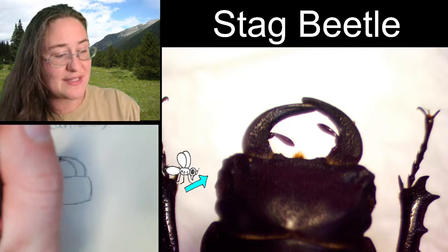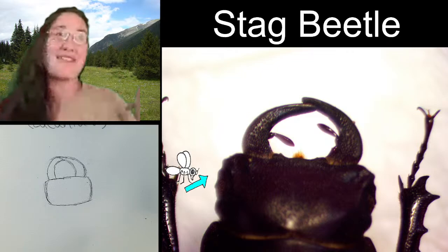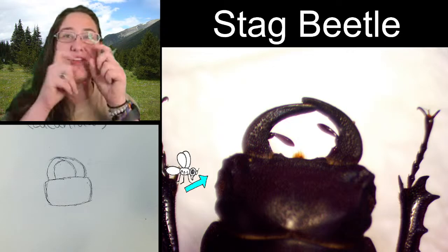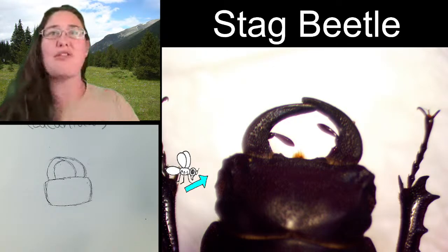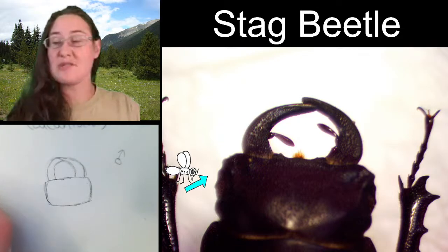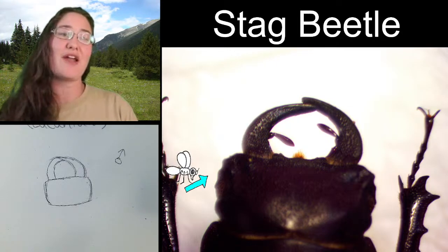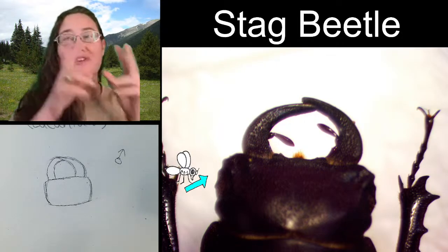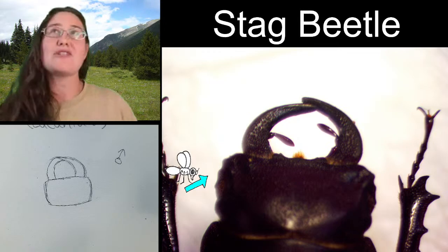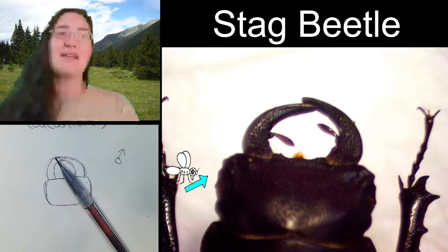You may be seeing the labial palps — those little segmented guys on the inside of the mandibles. Sometimes we call those mouth fingers because they're a little segmented and they help push food into the mouth. Stag beetles like this male here aren't really going to be using those mandibles to eat — they're more going to be using them to fight off other males. But they do have those little itty bitty mouth fingers to push food into their mouths, and they do eat rotting wood. We call it detritus — dead and dying plant material. Let's move on to the pronotum.